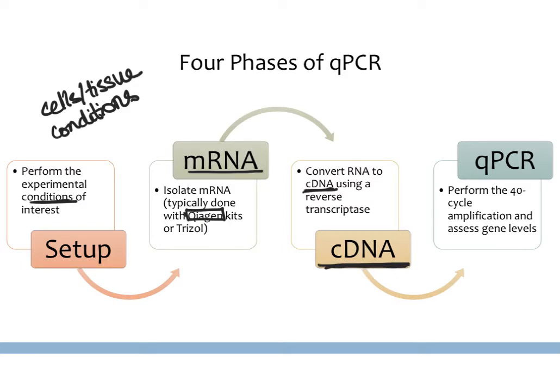Once you have that cDNA, then you will be ready to actually perform the qPCR reaction, which, as many of you know, is a 40-cycle reaction where the amplification of your genes of interest are measured. So we will go through each of these phases in more detail now.